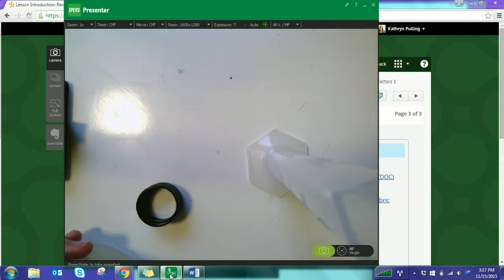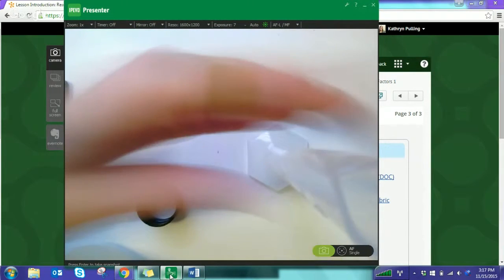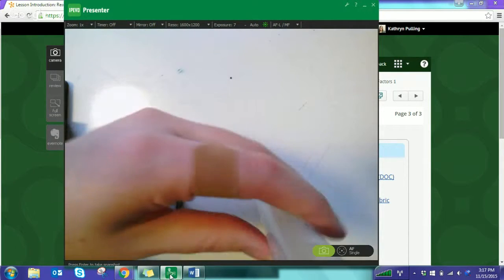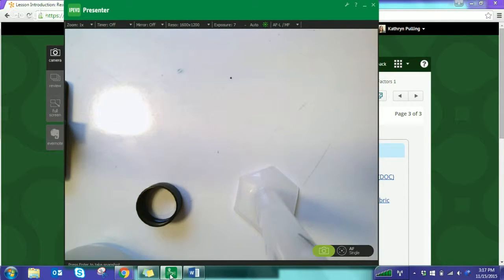Each of these pipettes is 2 or 3 milliliters. So I'm just going to fill that up until I have 20. Oh, I'm sorry. So 20 is going to be a little bit higher on there than I said before. We're getting 20 milliliters of this. And what I'm going to do is I'm going to get everything into my graduated cylinders and just leave it sitting there. I'm not going to start mixing anything until I continue reading through my directions.